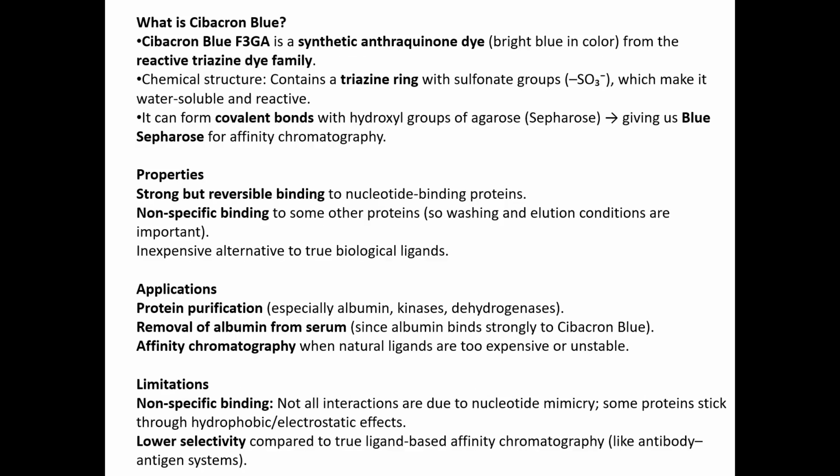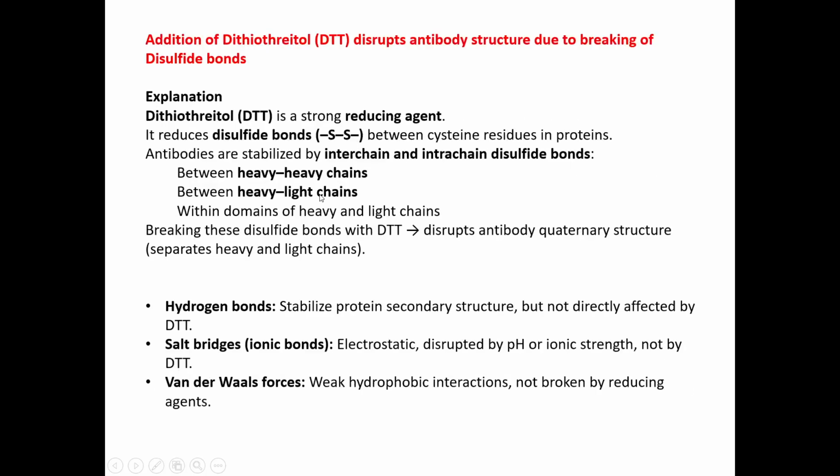Then Cibacron blue, a few other details of this: it is a synthetic anthraquinone dye, and it is bright blue in color, and it is a reactive triazine dye. It belongs to the triazine dye family. And then the chemical structure, like I said, is similar to your cofactors. So it has a triazine ring, and it has sulfonate groups, which make it water soluble and reactive as well. Then it forms covalent bonds with hydroxyl groups of agarose, giving us blue Sepharose for affinity chromatography.